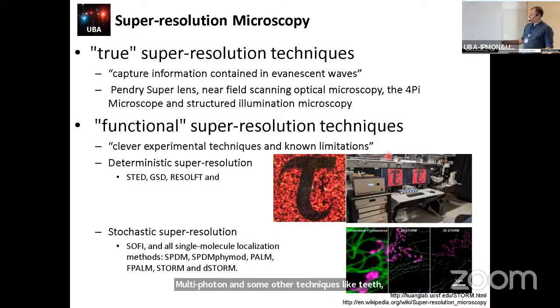Just to mention, in the third day we will learn quite a lot about super resolution. There are different kinds of technology, and this technology deserved the Nobel Prize in 2014.